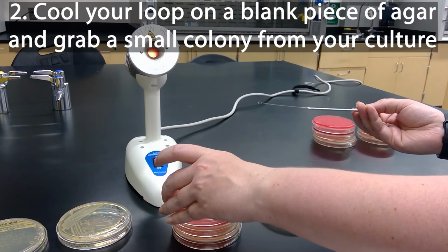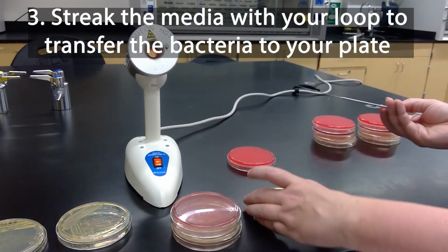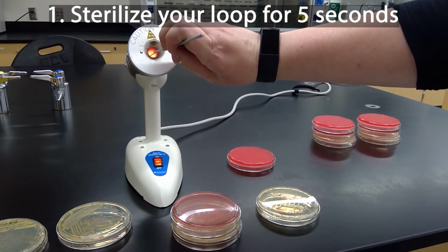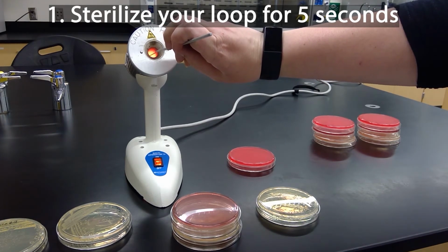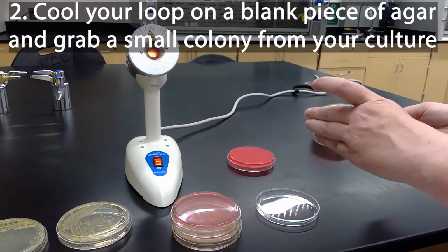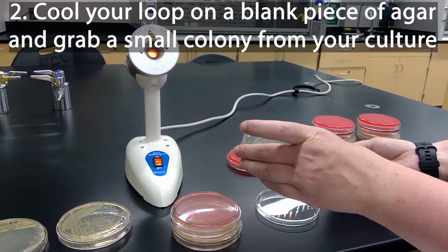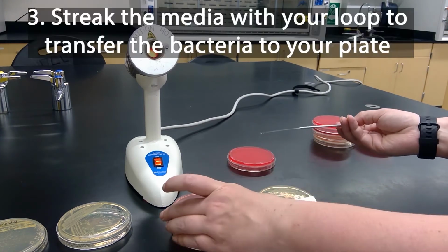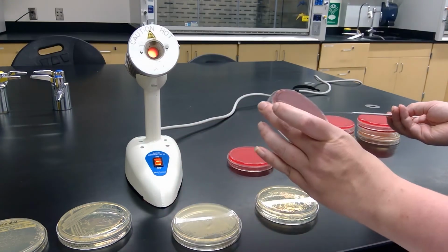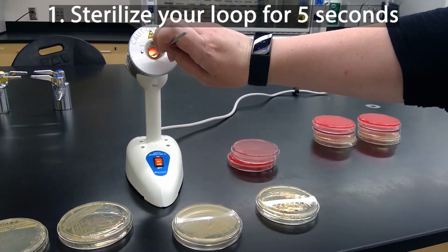And then you just streak it. And then we'll sterilize our loop again. Then we'll grab some culture and then streak it onto our plate. And then we will sterilize our loop again.